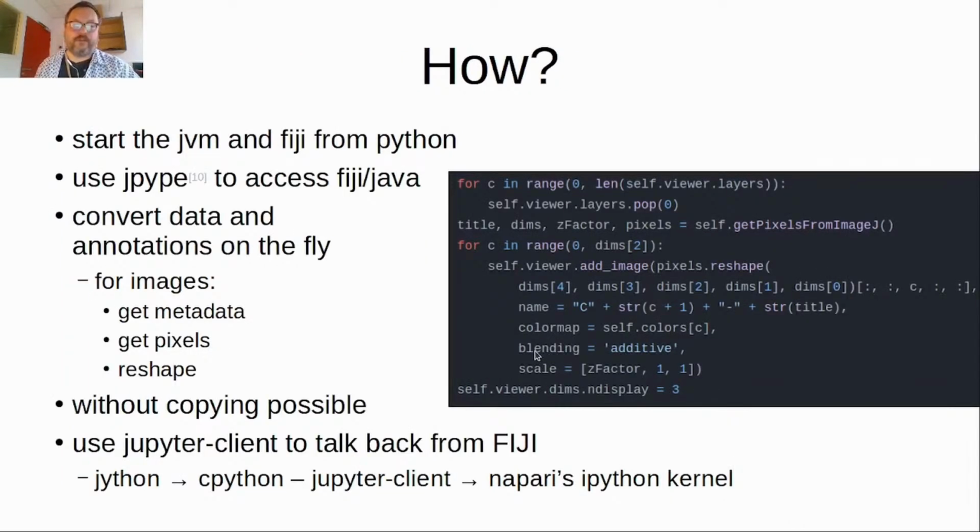How can we do this? We need to start the Java virtual machine from Python, and then we can use the package jpype, which allows to import and use Java packages and classes. Then we can convert the data on the fly.